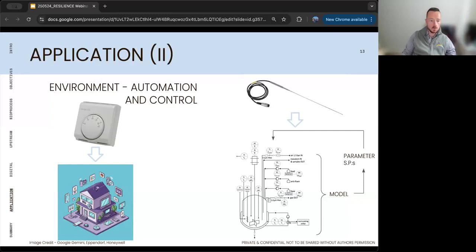And so you can think of the ideal state like a series of connected smart home devices. You can control your heating, lighting, TV, sound system, even your vacuum cleaner, all from a voice-activated device. And this is really what you want for the optimal control of your bioreactor environment. Rather than your classic PID loop, you have your temperature, dissolved oxygen, pH, all being controlled in the context of the others.